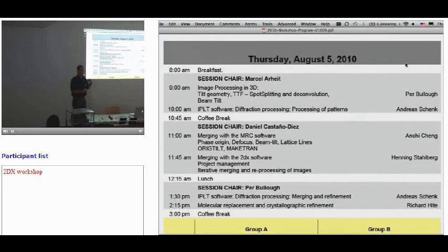We were really excited to have Richard here. So initially the plan was that I would present how to use 2DX image on Wednesday. I don't know of any lab that does work on membrane proteins with 2D crystals and has not at least downloaded 2DX image. So I think there should be interest in how to use it. And then Richard agreed to come.